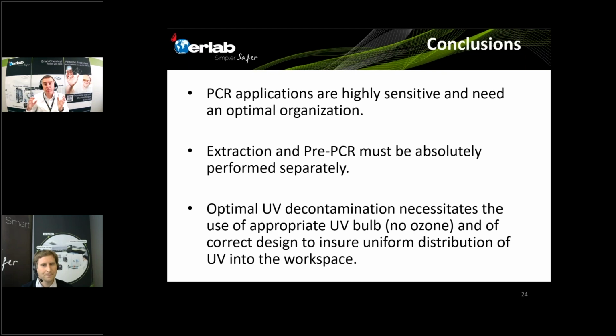And in the Flow, you've got no UV bulb, no UV insulation, and this is only in Europe. The thickness of the PMMA panels in the Flow in Europe is only 8 millimeters, and these vented workstations are used to produce a dust-free space for typical biological applications, electronics, cell culture when the cells are not pathogenic, or things like that. That's what is done in Europe.